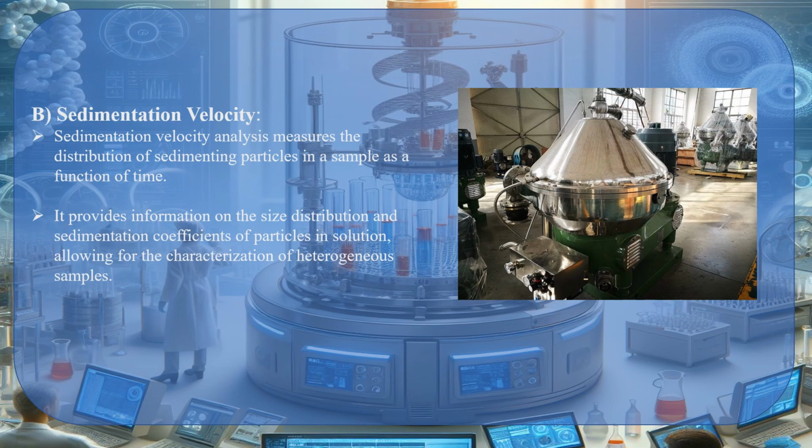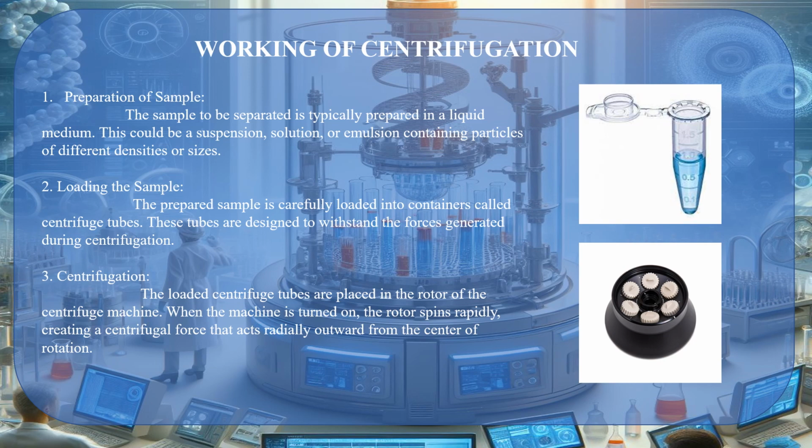Next is sedimentation velocity. It measures the distribution of sedimenting particles in a sample as a function of time. It provides information on the size, distribution, and sedimentation coefficient of particles in a solution, allowing for the characterization of heterogeneous samples. So the working of centrifugation is: preparation of sample, loading the sample, centrifugation, separation, and so on.